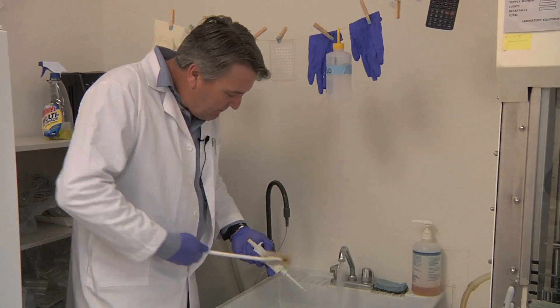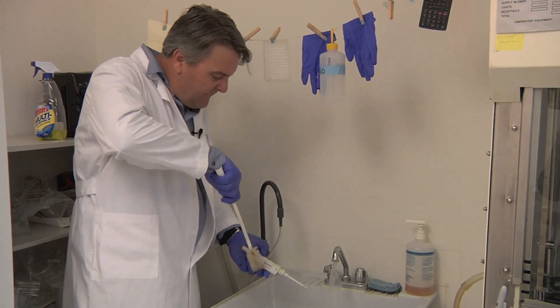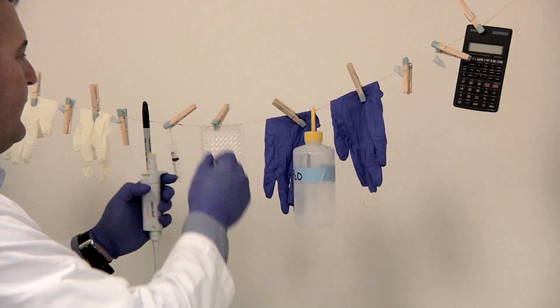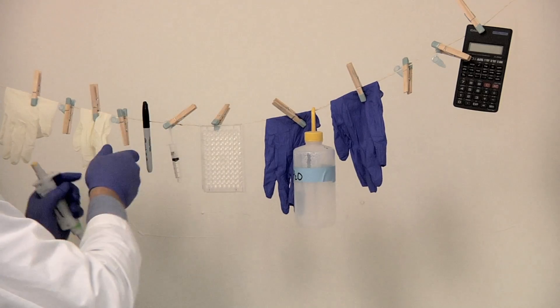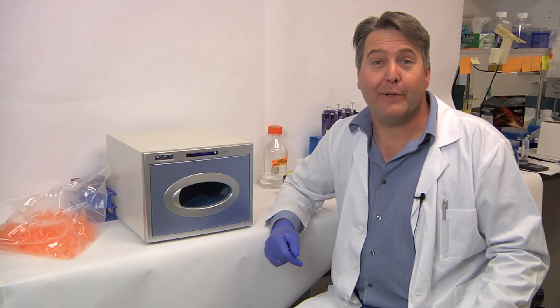We understand that you're way too busy to be worrying about keeping your lab bench clean, sanitized, and free from contamination. So that's why we developed the Koolclave.